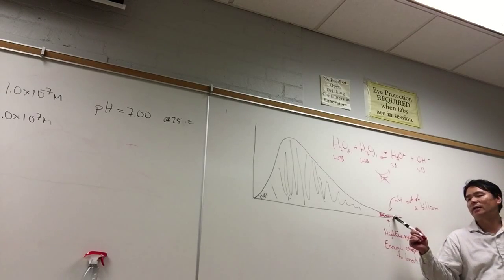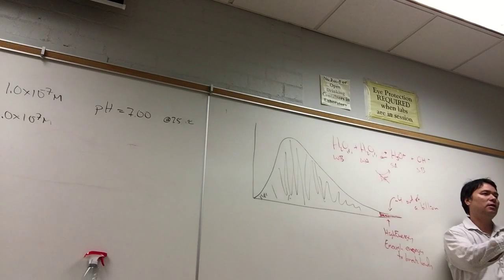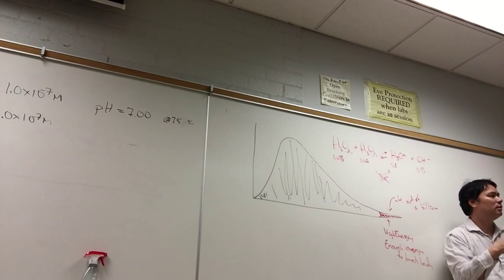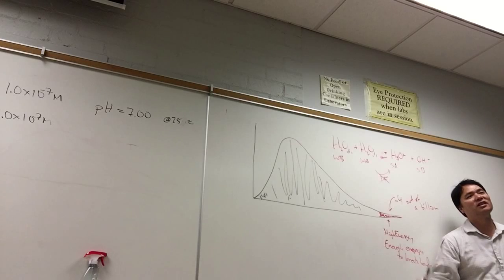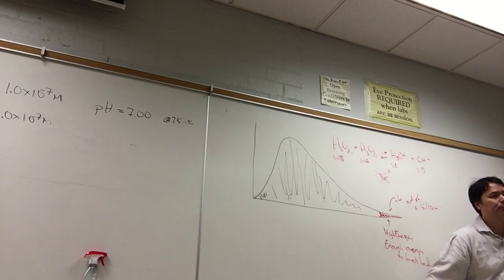Because if one of these high energy water molecules strikes the surface of barium sulfate and knocks ions off, then a little bit just dissolved. Right? And so the more water you wash it, well, the less barium sulfate you're going to get. Because a little bit will dissolve, no matter what you do.